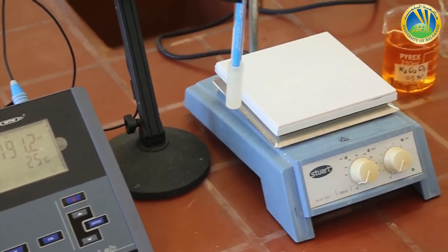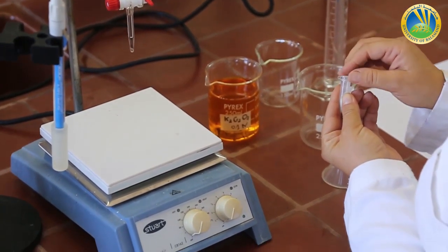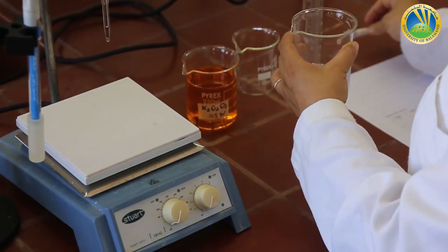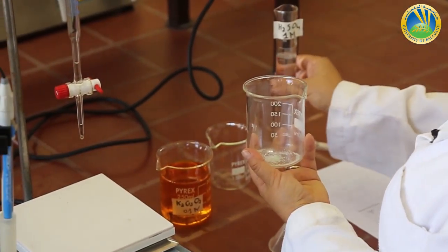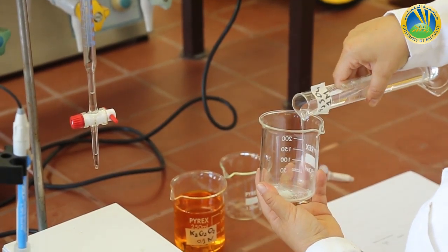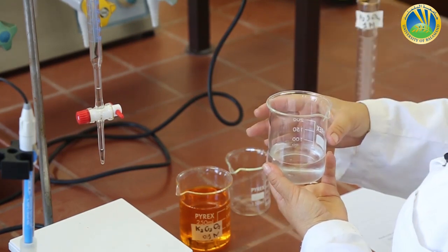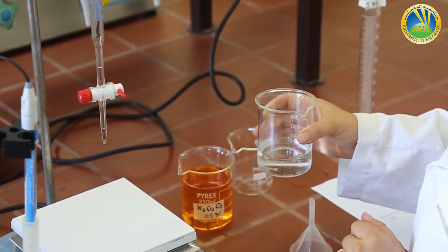As every titration experiment, we need to fill the burette and to put our crystals in a beaker. This titration will be using a beaker instead of an Erlenmeyer, for the only reason that we need to dip an electrode inside. I put inside the FeSO4 crystals with an unknown weight, and I will add 90 milliliter of H2SO4 1 molar.